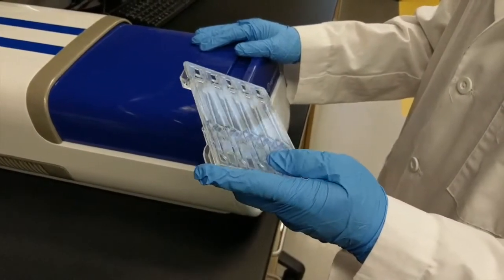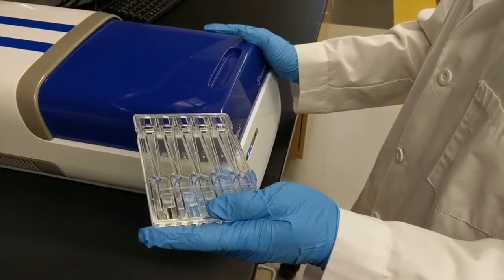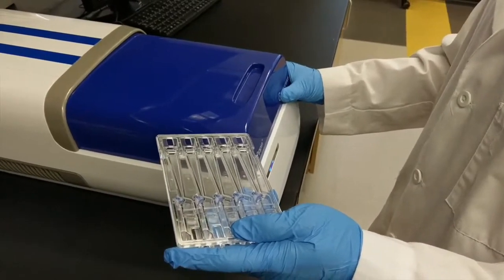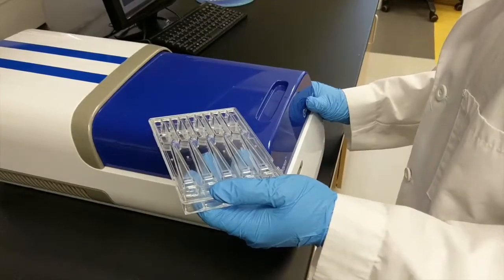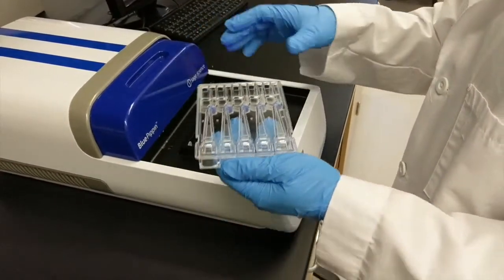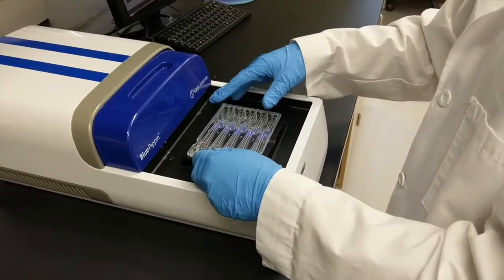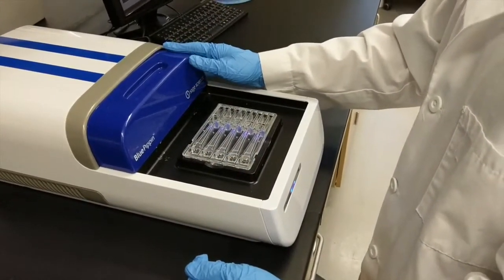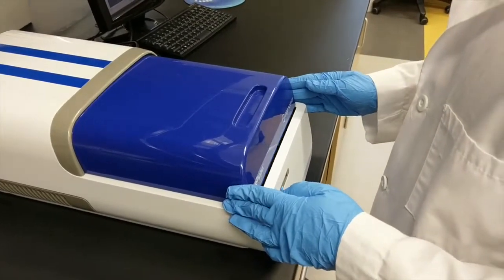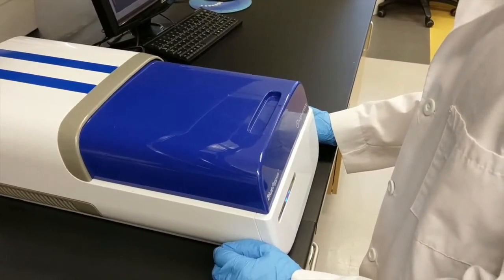So now that we have tested that our adapters have ligated and our fragments have fragmented to the appropriate size, we now need to actually select the size that we need in order for Illumina sequencing. The Blue Pippin uses a gel-based protocol in order to select the appropriate size. In this case, we're looking between 438 and 538 base pairs. This will run for half an hour. When done, we will have the appropriate size of DNA with which we can start sequencing.